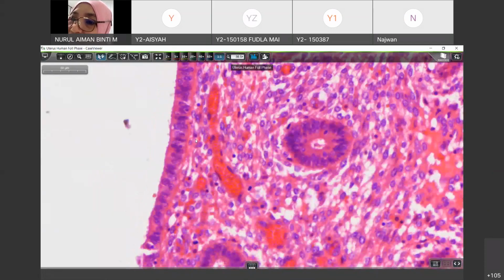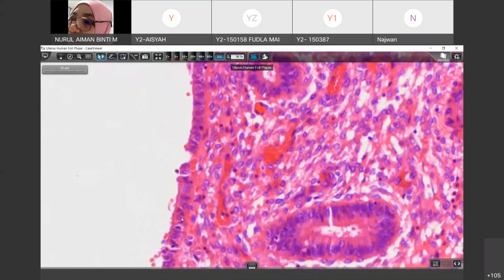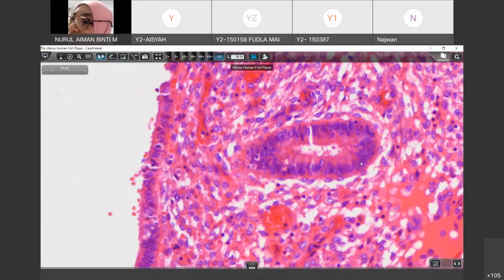But inside the uterus, it's quite difficult to find peg cells, even though the notes mention peg cells in between. Even in the endometrial glands, most are simple columnar ciliated cells. It is too packed to find the peg cells.